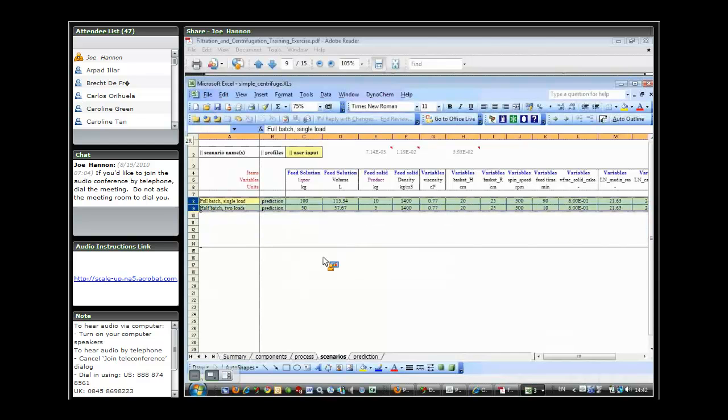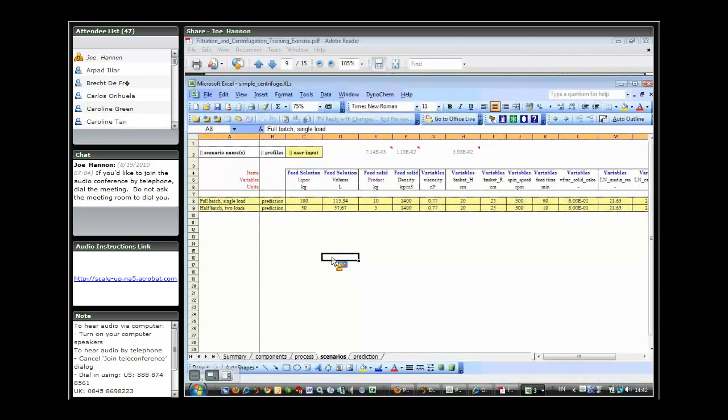We've set it up to just do a single load and two loads of the same total quantity of material. So that's what I'm going to read in now into the simulator window.